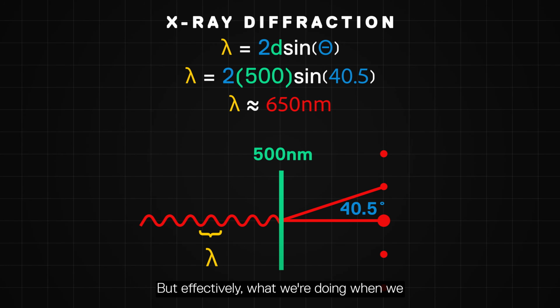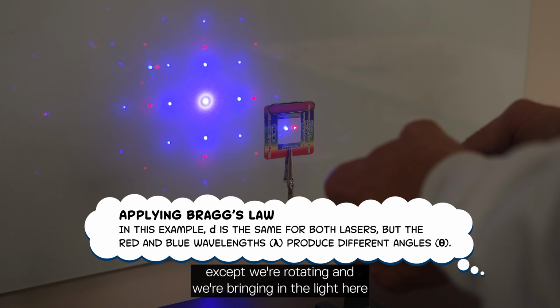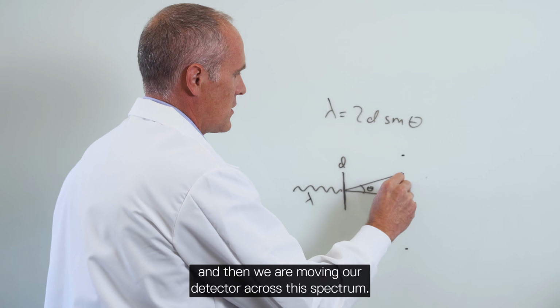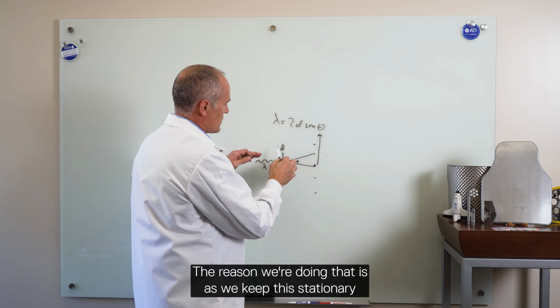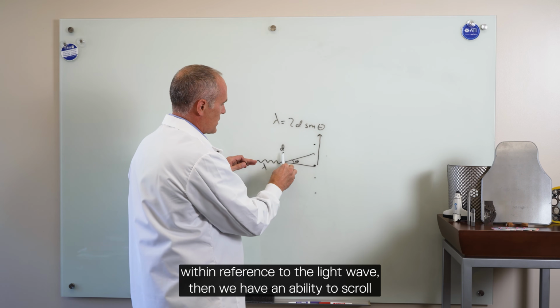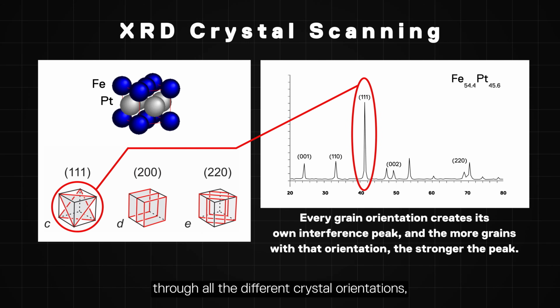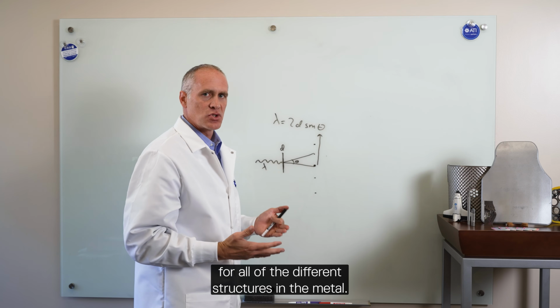But effectively, what we're doing with an X-ray diffractometer is the same setup, except we're rotating and bringing in the light here, and then we are moving our detector across this spectrum. The reason we do that is as we keep this stationary with reference to the light wave, we have the ability to scroll through all of the different crystal orientations, and then we scan at 2 times the angle on the detector, and we can get a full picture of what's happening for all of the different structures in the metal.